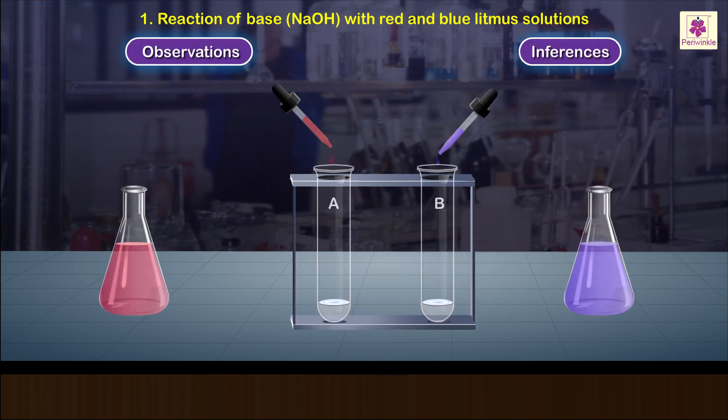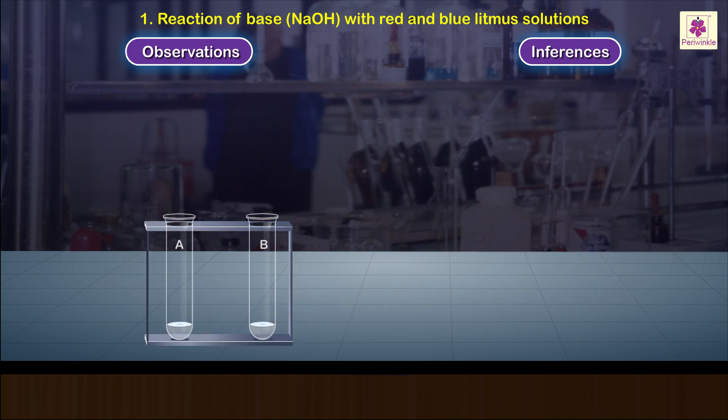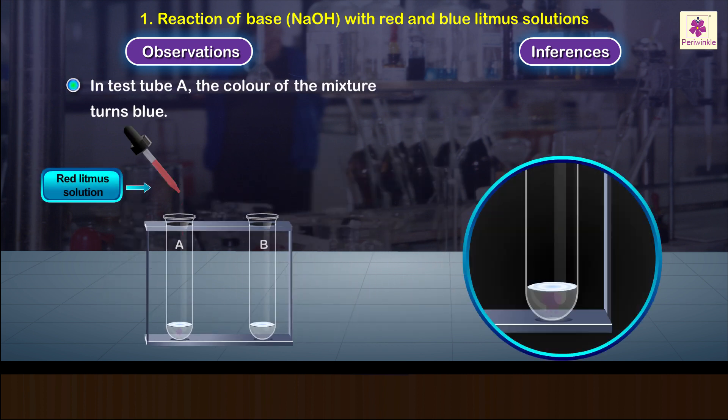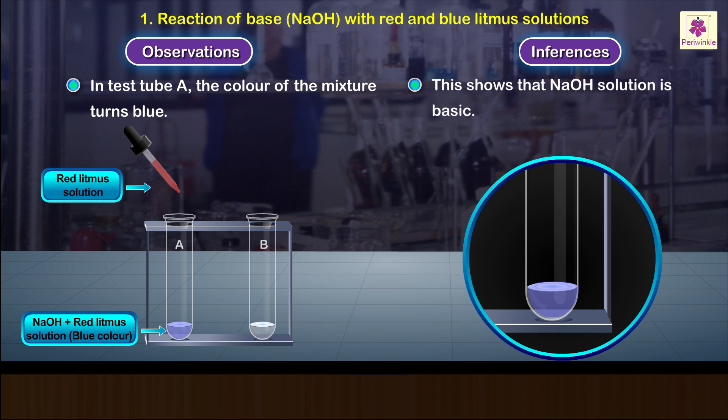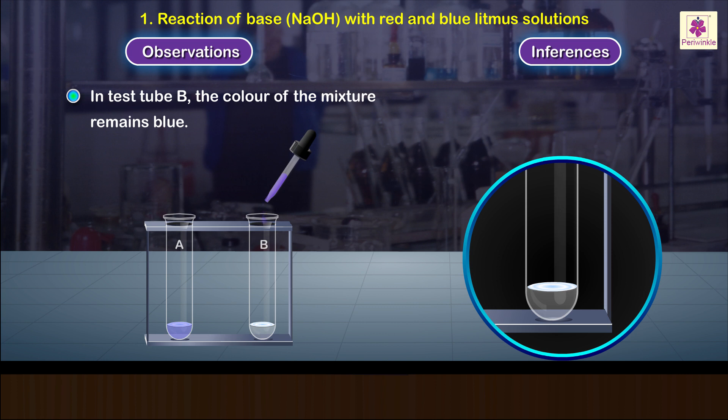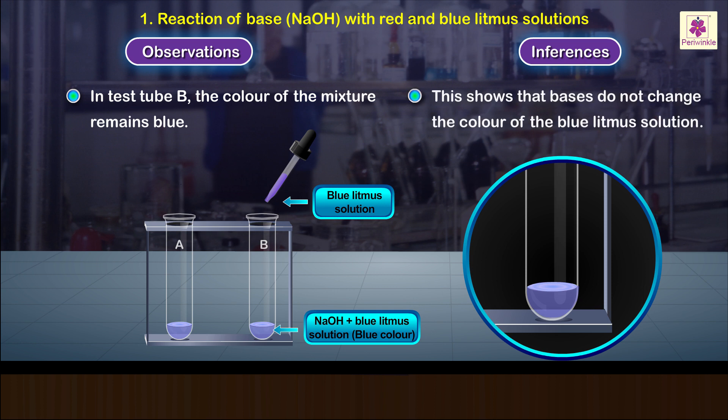Observations and inferences: In test tube A, the color of the mixture turns blue. This shows that sodium hydroxide solution is basic. In test tube B, the color of the mixture remains blue. This shows that bases do not change the color of the blue litmus solution.